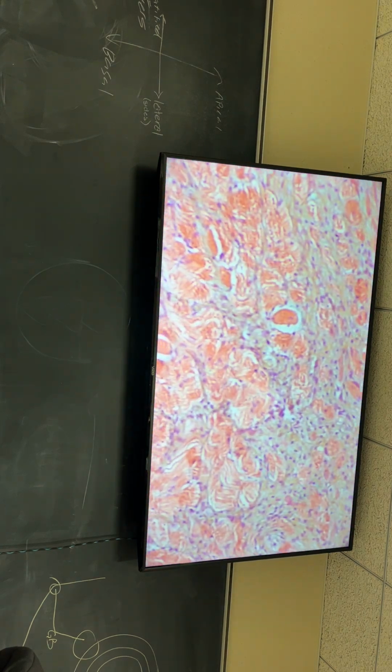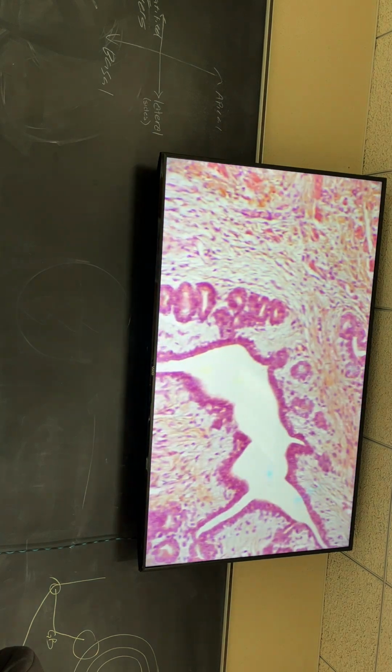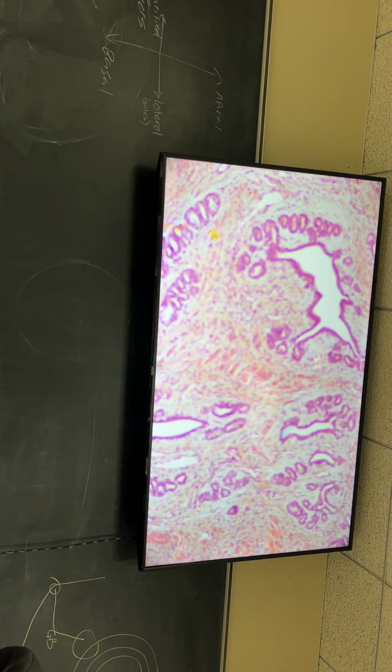All right, I'm just gonna test you on one slide for the whole test. That'd be great. Let's see. Ooh, wait a minute, what's that? That's weird. Let's go down. What the heck is that?